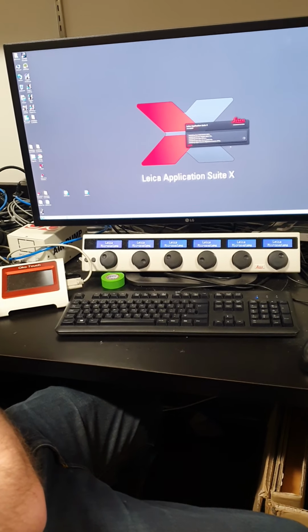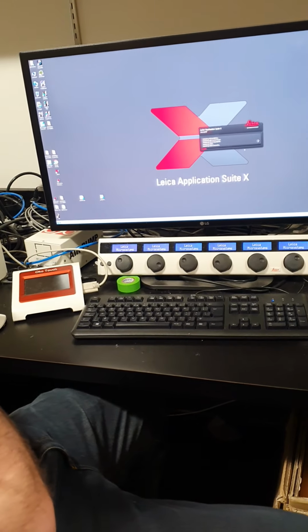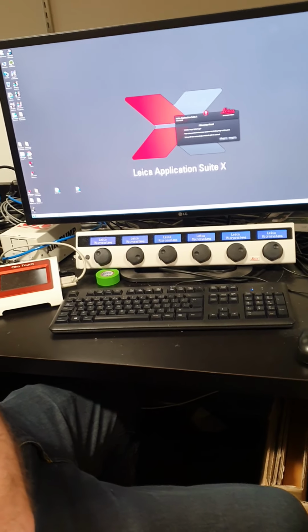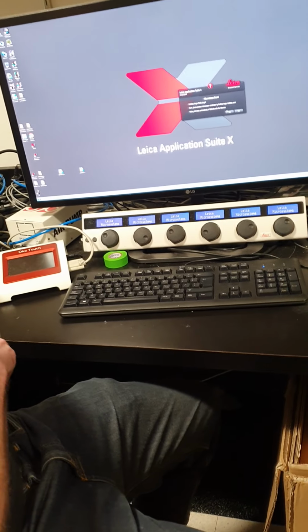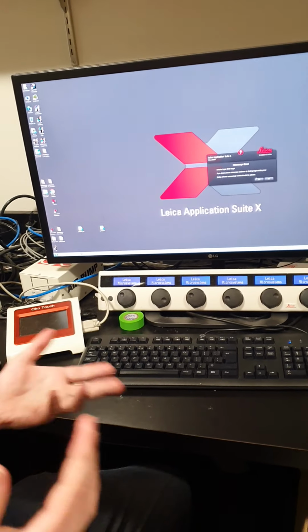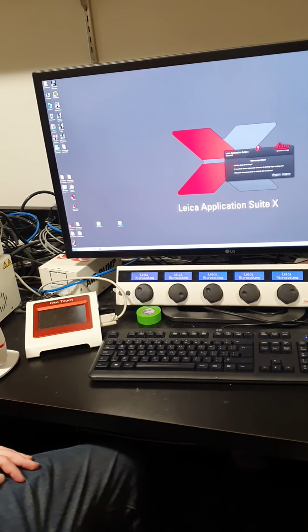Quite a process, I believe, yeah. And fluorescence, normal one, simple one, we just put slides, take image, and go home. Yeah, it is a process, but it does wind up very capable and lets you do some cool things.